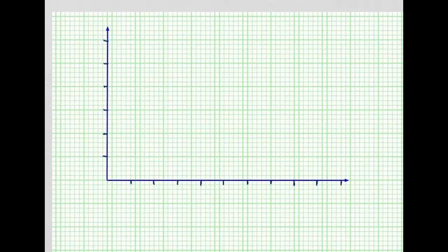You draw your axes. And one of the biggest problems that lots and lots of students have is they get so overwhelmed with the beauty of the graph paper and their axes that they say, wow, it's so beautiful. You know, I don't need to do anything. Actually, I would like to know what these axes represent. It would be nice to know what these axes show.